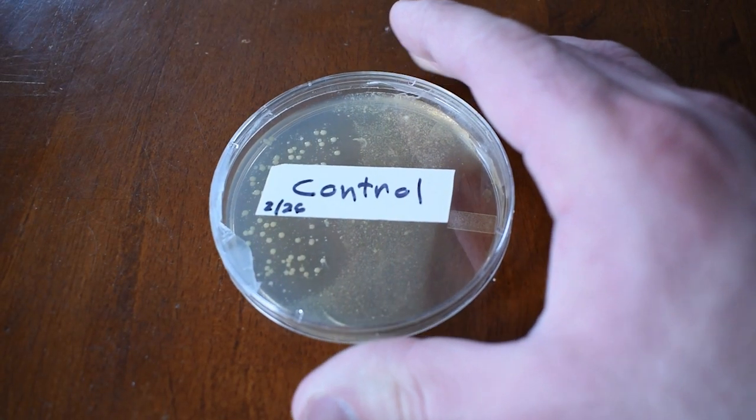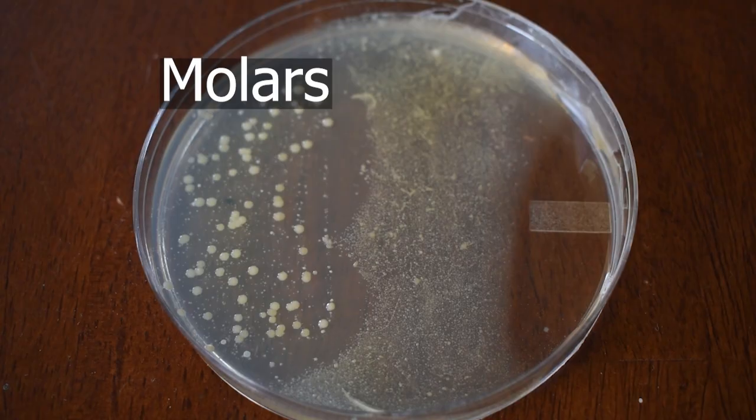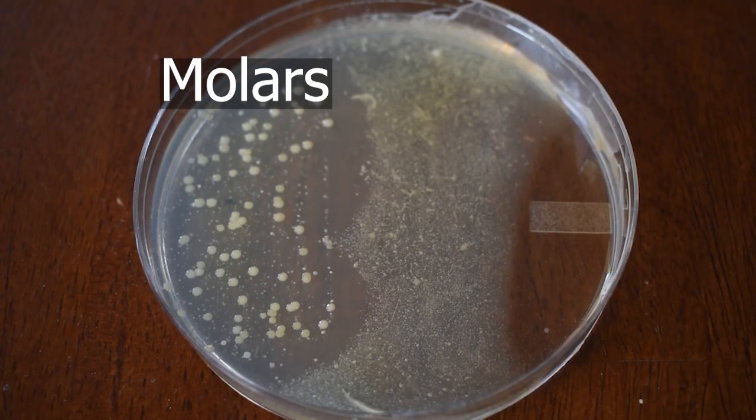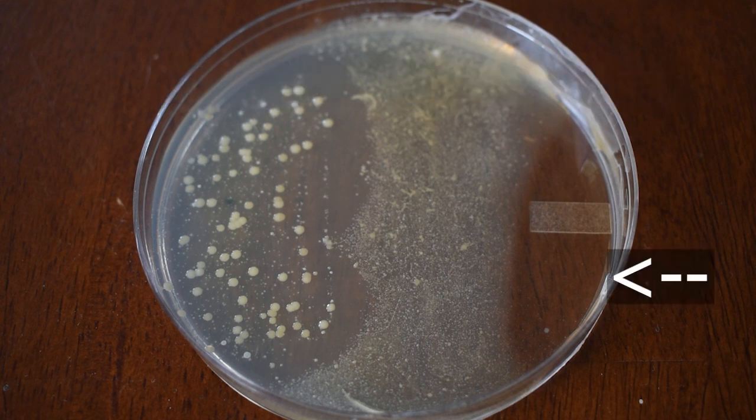First up is the control plate where I did not brush or use mouthwash, hence the large bacteria growth. The culture on the left is from my molars, and on the right is from my front teeth. This clear patch right here is from a buildup of water, as the plate was sitting at an angle. When condensation built up, water ran down into this side of the plate, causing bacteria to not grow there. Overall, this is a standard control plate with very high bacteria density.